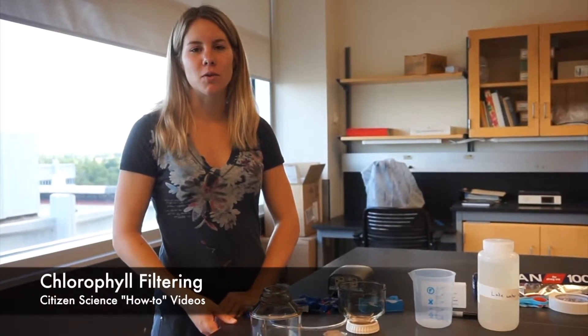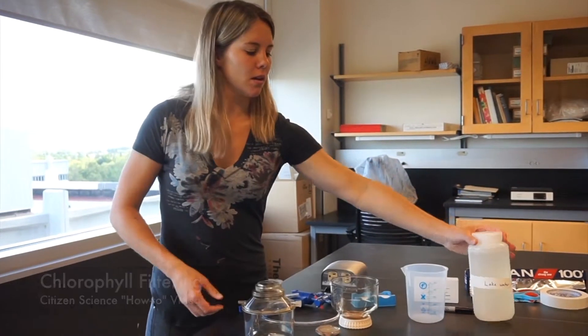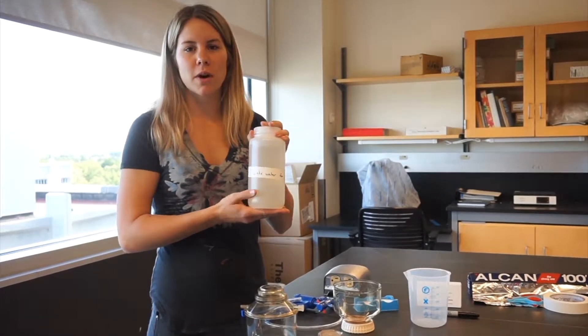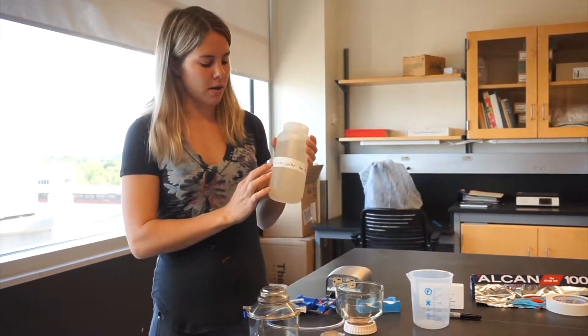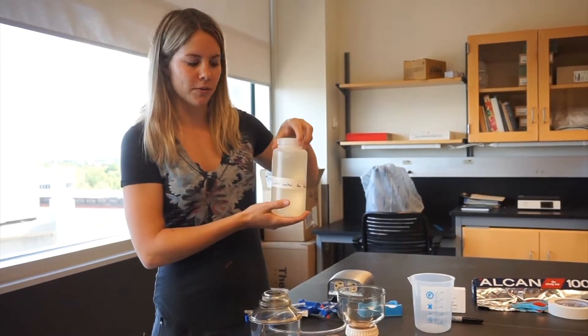This is the how-to for the chlorophyll filtering. You're going to start with your 1 litre of filtering water that you should have collected on the boat. It's in your Nalgene labelled lake water for filtering.